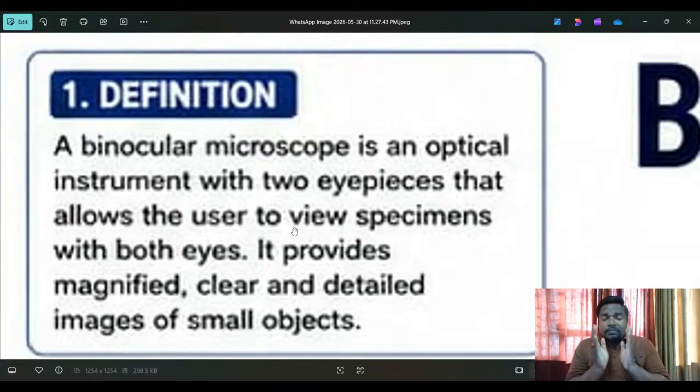By using a microscope, we can observe and find out microorganisms in blood and everything, for observation and study purposes, and to find out issues of the blood. If you want to check the blood group also, you have to check it this way. Where we are using it, I'm going to explain everything.